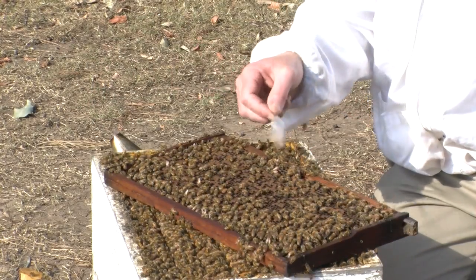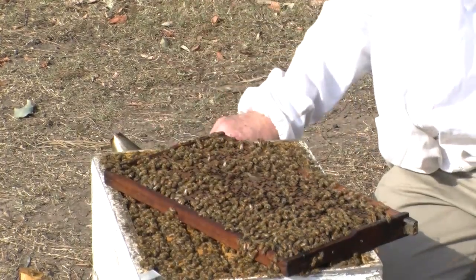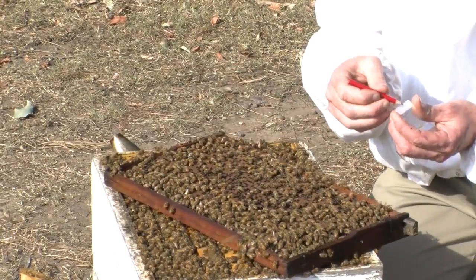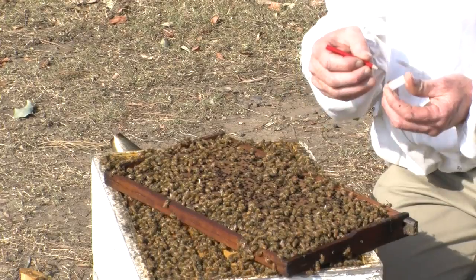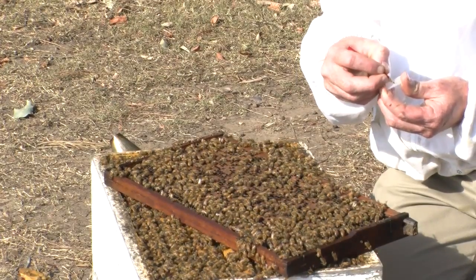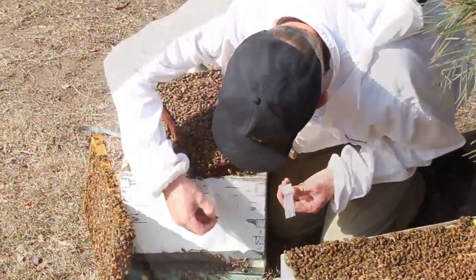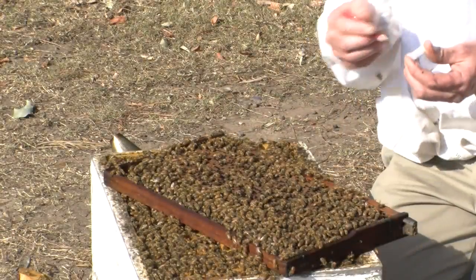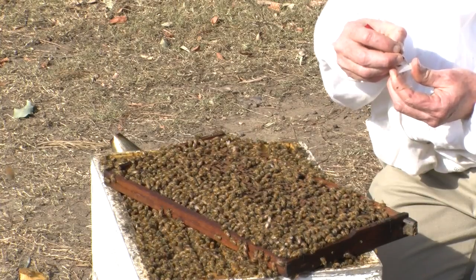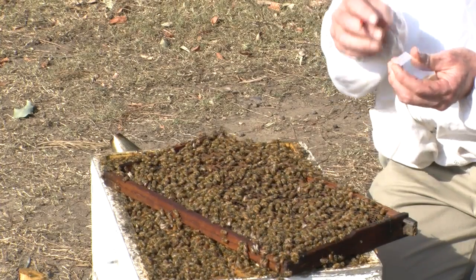Let that dry. While we're letting it dry, I use slides with a frosted end to enable writing on the slide the number of the hive, and also I put my registration number on here. So I'll put hive number 10 and write it on the box so I can come back and identify that particular hive later, and write down the registration number on there.